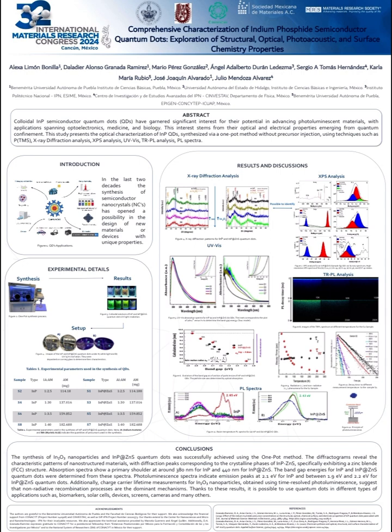But an important thing here is that we don't have those samples here, but samples that have a core shell. When they have a core shell, the indium phosphide bonds are complete and the radiative phenomena will be present.